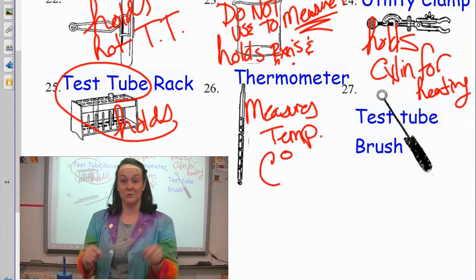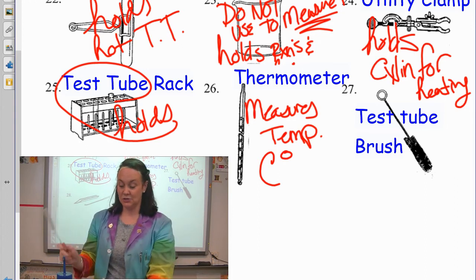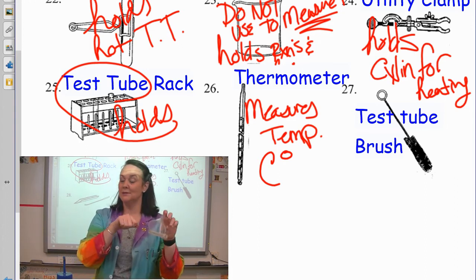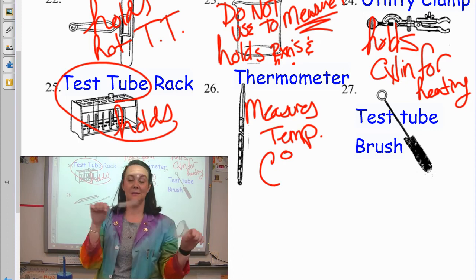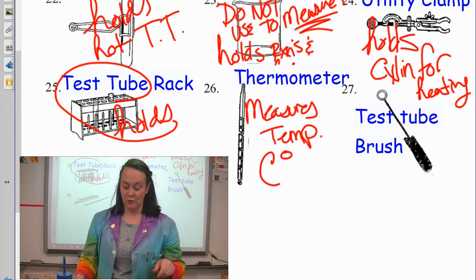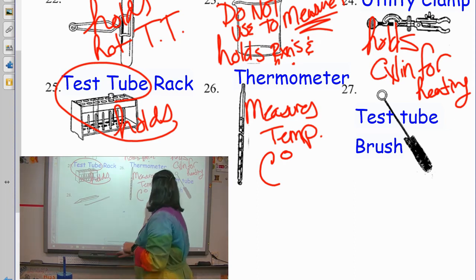A test tube brush can clean a watch glass. A test tube brush can clean a funnel. Test tube brushes are amazingly, amazingly universal. So test tube brush is for cleaning.